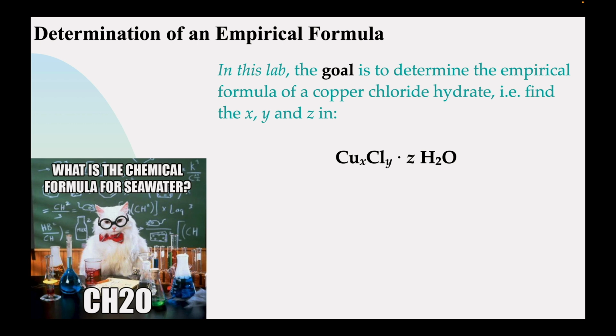The hydrated compounds are usually quite beautiful, and in this lab, as you'll see in a little bit, the copper chloride hydrate we're using is quite beautiful in my opinion. Now, of course, I need to get out more. I'm a chemist, etc. However, I think you'll find that they're a lot more spectacular with the waters than without, as we'll see in a little bit.